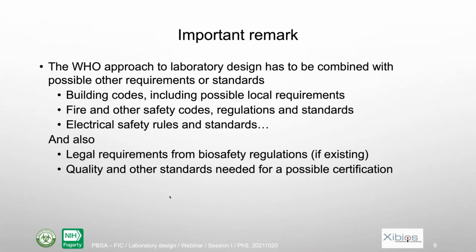Still, an important remark, when we deal with laboratory design for a biosafety lab, we need to take into consideration a number of possible other requirements and standards. For instance, the building codes, including possible local requirements, and also the fire and other safety codes, electrical safety rules, and so on. So you need to add those requirements to the biosafety needs, I would say.